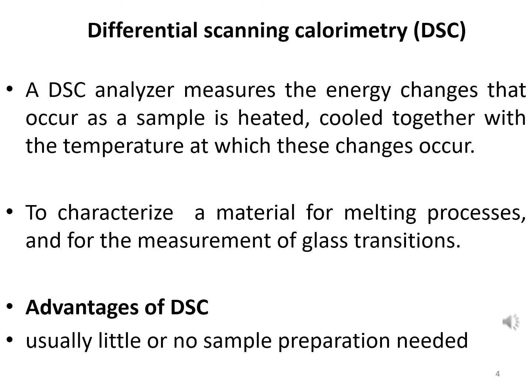So, in differential scanning calorimetry or DSC, next we will discuss its instrumentation and the DSC analyzer. We already discussed differential scanning calorimetry's principle and its introduction. So here we will discuss instrumentation in the next slides.